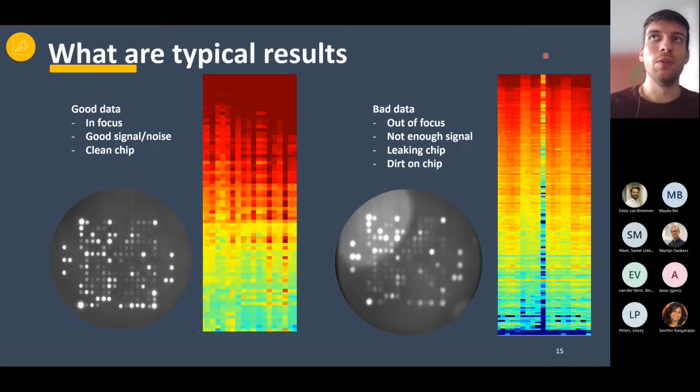This is an important step to look at quite strictly. If you see a lot of bad data, you might also need to consider whether your PAM station is still performing correctly, or whether the experiment has been performed correctly. We have a number of strategies that could help you to find this out, and I will give you a couple of examples in a little bit. Of course, this peptide data is the beginning of the analysis. It has to be right at the beginning.